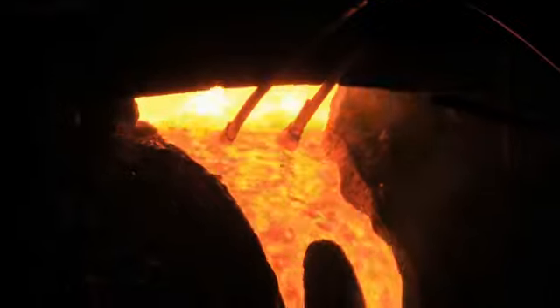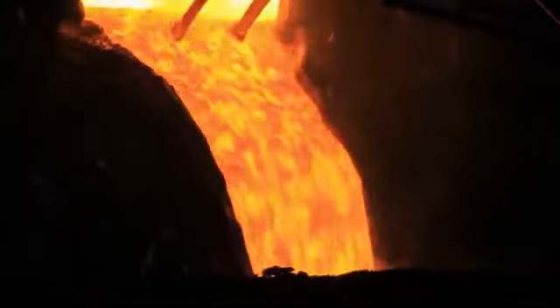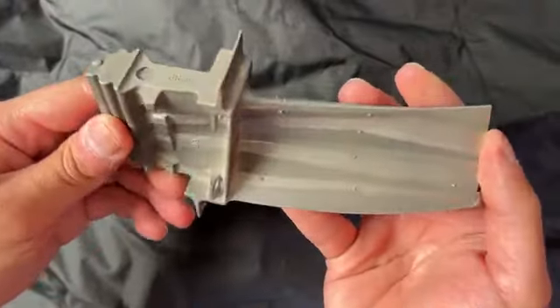My research focus is on metals and alloys, which are all around you, from bicycles to space frames to jet engine turbine blades. And generally, we prefer metals in their solid state, which necessitates cooling a high temperature liquid. And these solid metals have microstructures.